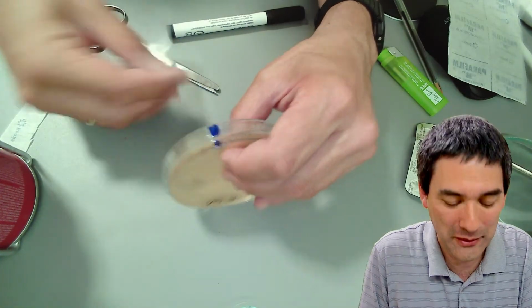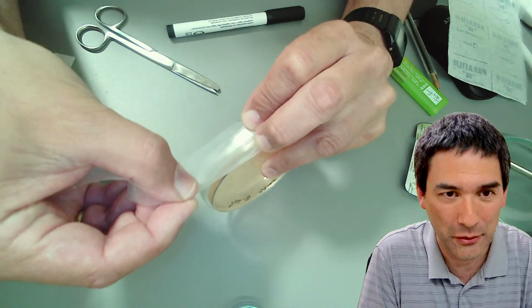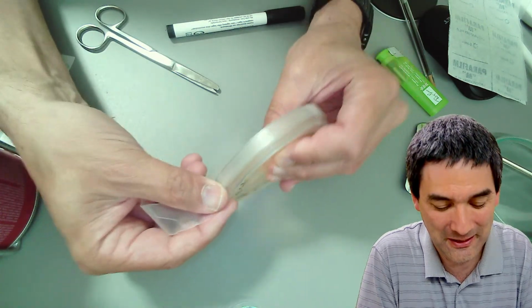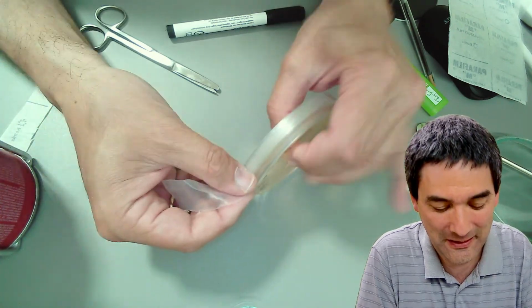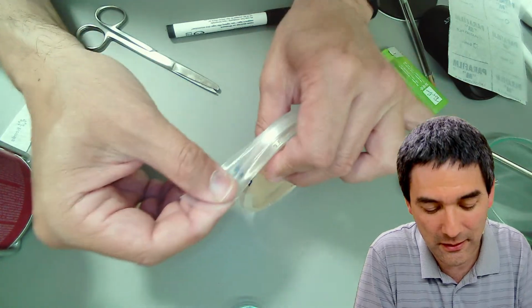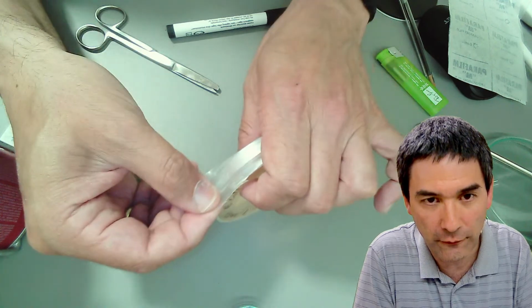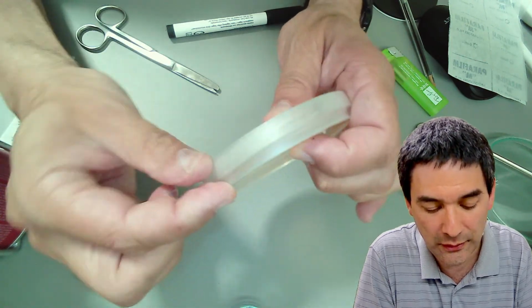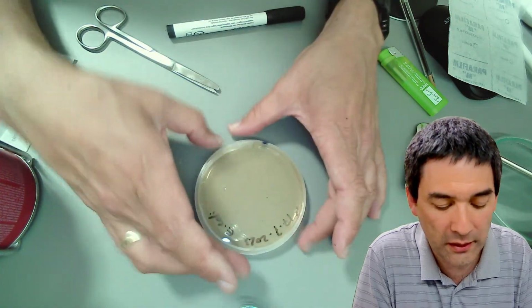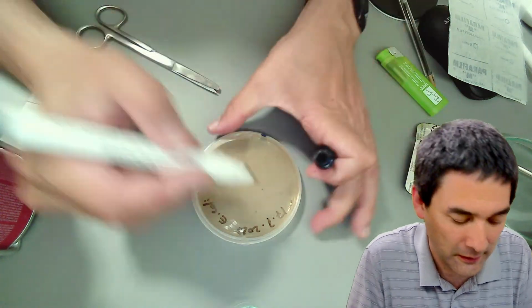And now I'm going to do the following. Look, I'm going to hold this here, and when you stretch it, it pulls out, and it starts to become sticky. Okay, and this is important to prevent the Petri dish from drying out. And that's it. And now I'm going to wait for, oh, the timer went off, unfortunately.